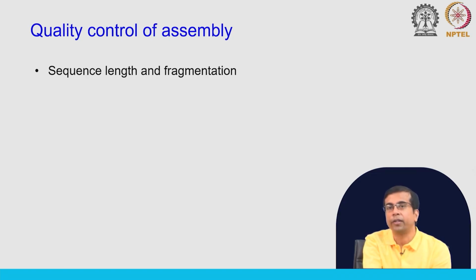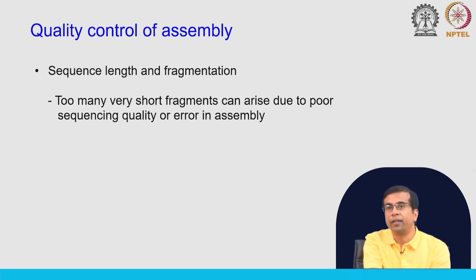We are working with an organism where we know probably around 10,000 genes are expressed, let us say. And if we see a huge number, much more than 10,000 fragments, obtained after assembly, this might mean that the assembly process was not very good, or there was not enough data for the assembler to do the complete assembly. So, this is what we can assess.